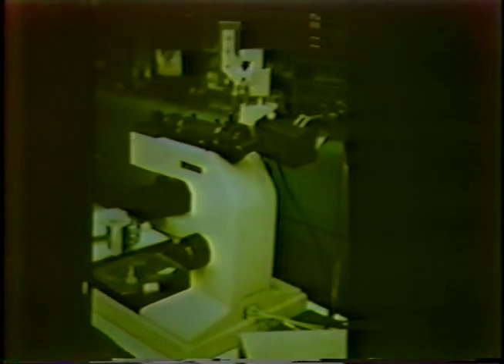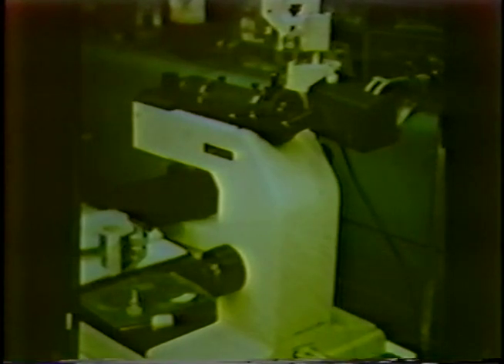Now, another characteristic of the confocal microscopes, which didn't interest me to begin with when I first started to look into using them myself, is the very sharp contrast that you get at focus and the effect of reversal of contrast as you go through focus.